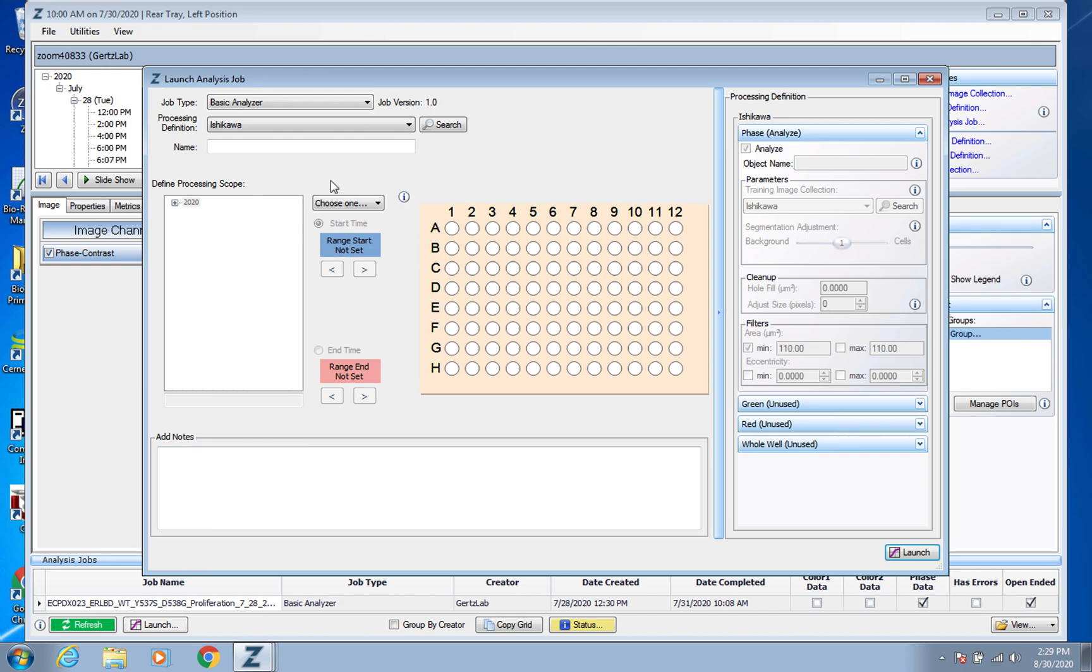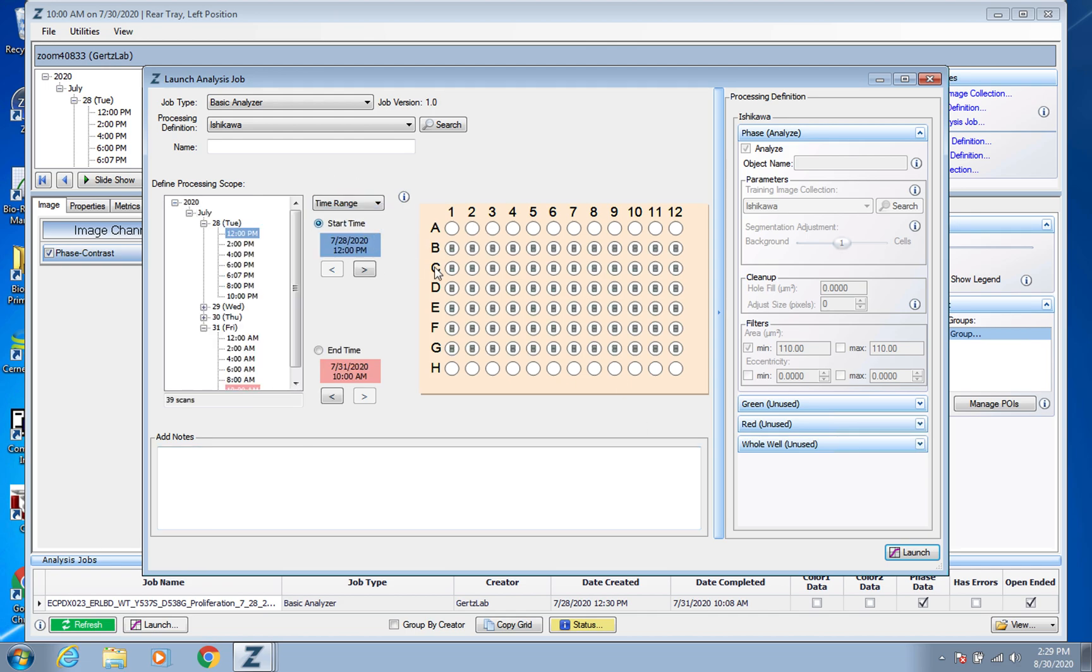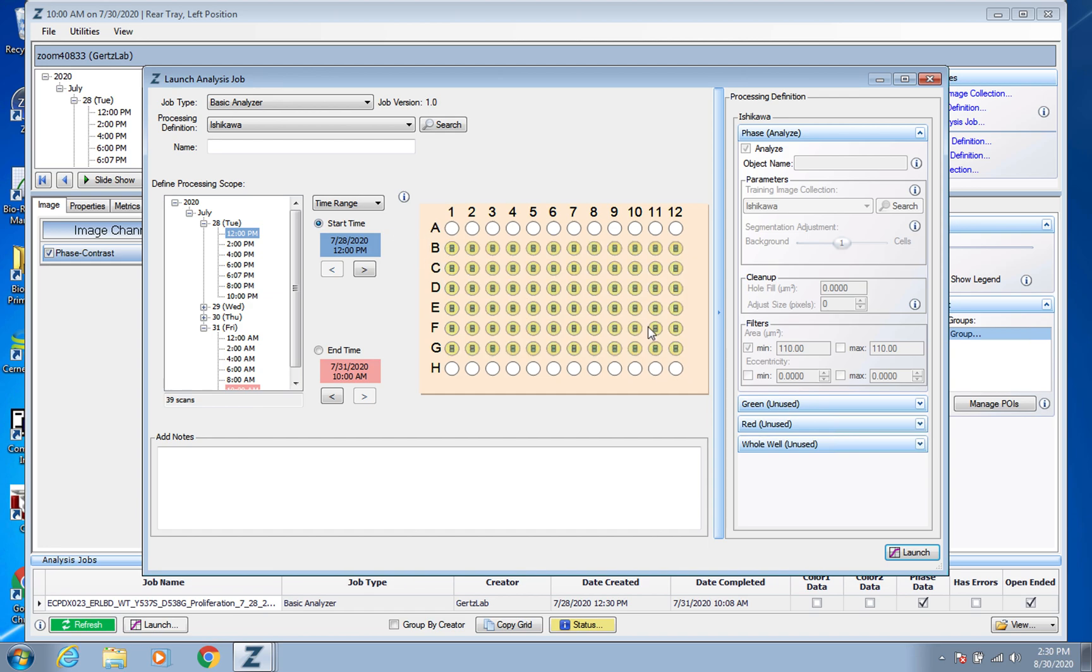You would pick your time range and pick your wells. You want to make sure that they're all highlighted here, make sure they're all in yellow and that you're covering all the times that you want to get and then press Launch.